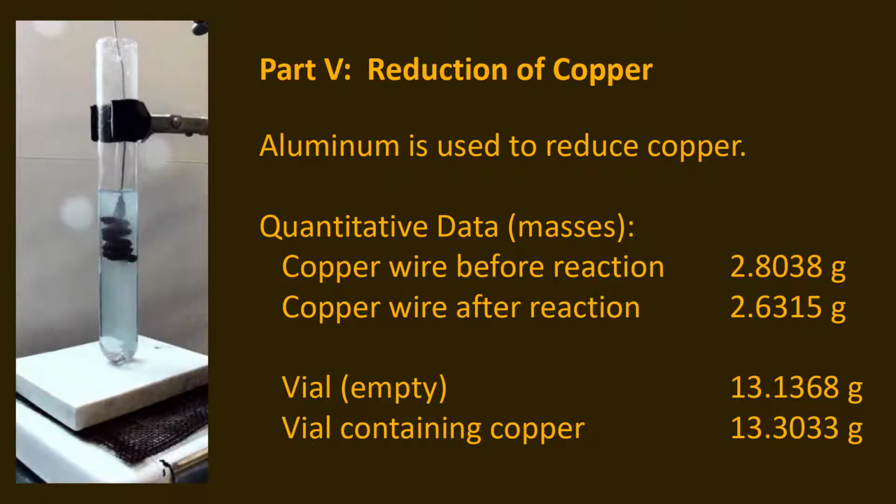I have a pre-weighed vial that I'm going to transfer my product into.